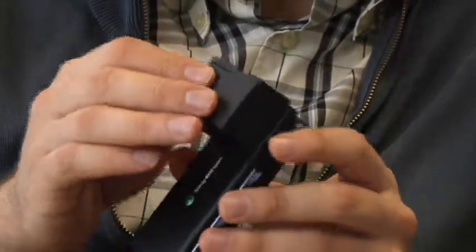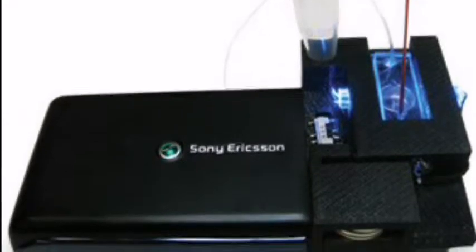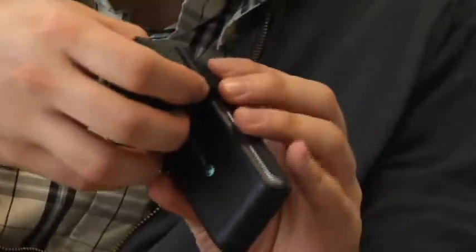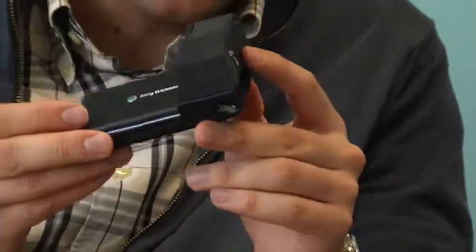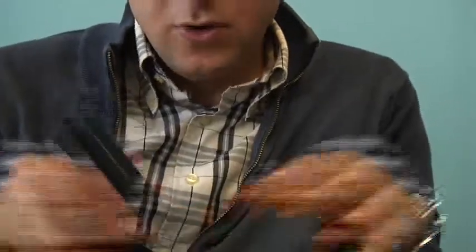and a flow cytometer at the same time, where we can load specimen. There are some light emitting diodes there which actually excite the specimen that you inserted from the side, and then the fluorescent emission is imaged by the cell phone, and there is a tiny filter here which essentially rejects the excitation light. This geometry allows us to create a wide field fluorescent microscope that essentially is quite powerful for looking at large specimen volumes and large specimen areas.